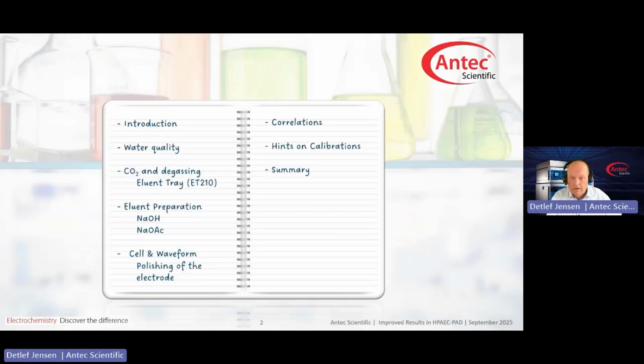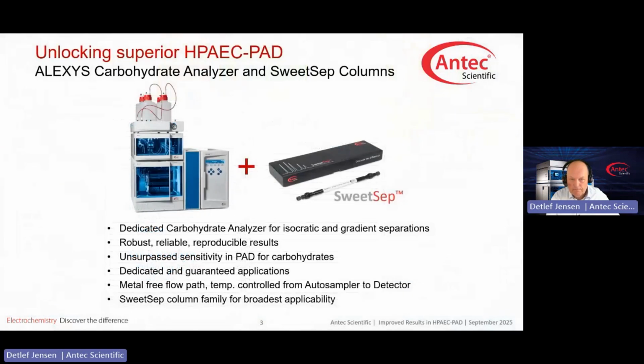And here's the agenda of today's presentation. We will begin with a very brief introduction, then address the water quality question, followed by a discussion on eluent degassing and preparation, as well as cell and waveform topics. And finally, there will be a section on calibration. Let's get started and jump right into the introduction.